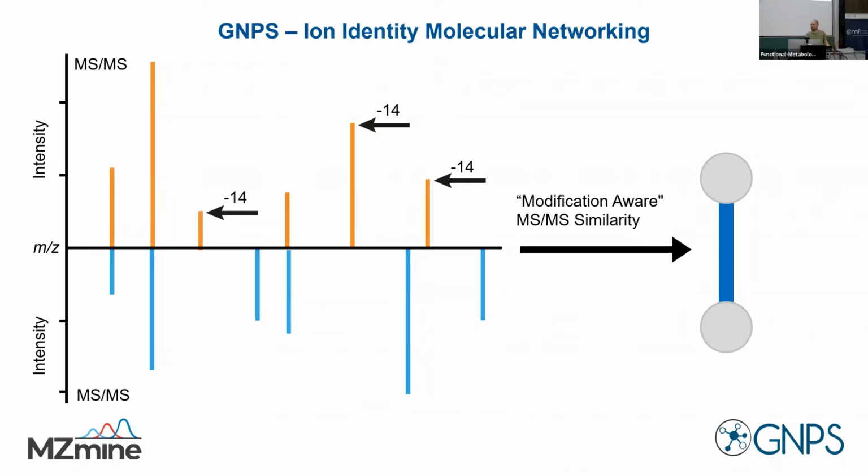Now if you have a very complex data set where one node is related to many molecules, then once it reaches 10, the lower scores will be cut off. And then there's also, I think, a maximum network size. That's very critical for very complex data, or especially if you have chemical classes that have many variants. Once a subnetwork reaches a certain size, it will also be cut off.